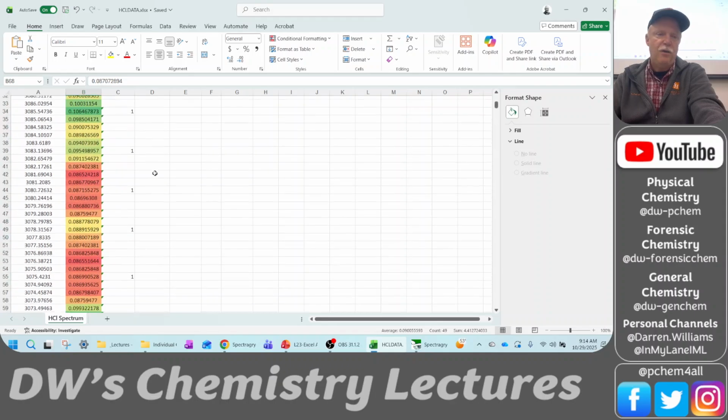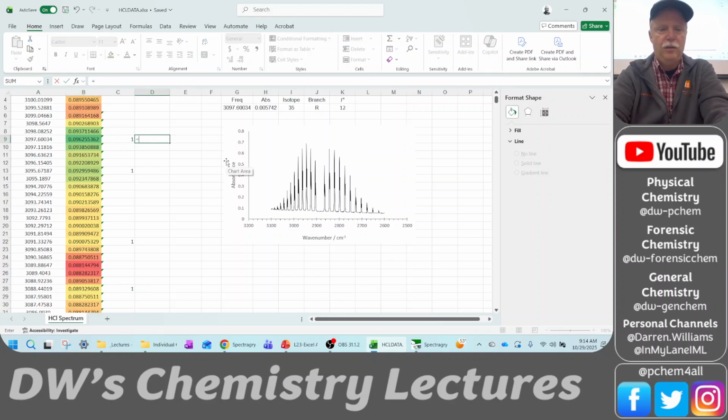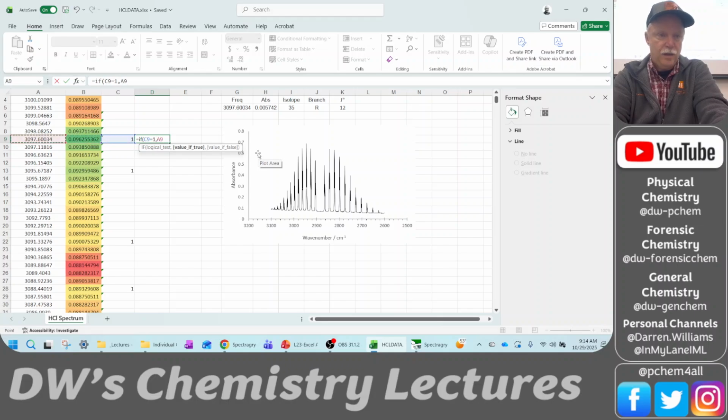Okay, so now what do we do when we have a flag? We'll do another one that says equals IF. These if-then statements are essentially what I'm doing in my head when I'm picking peaks. So I'm saying if there's a flag, if this equals 1, then go get that value, okay?